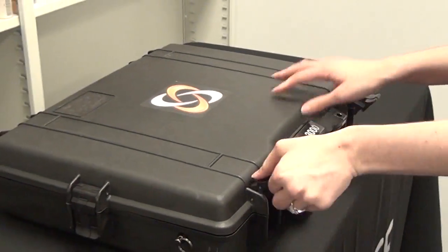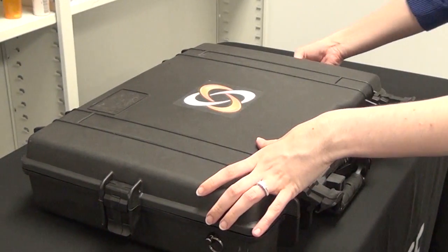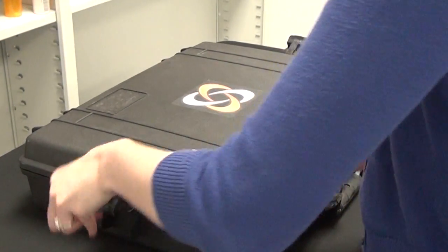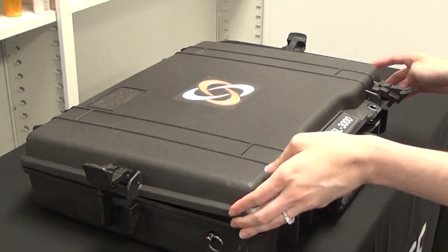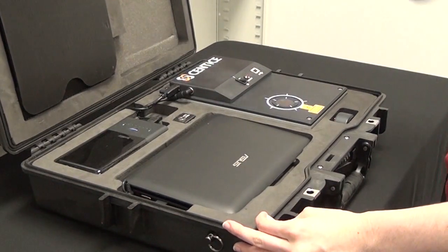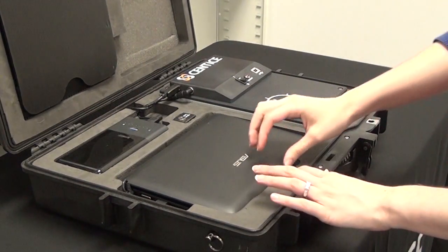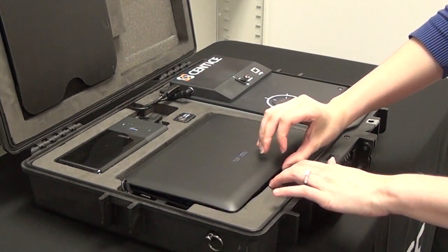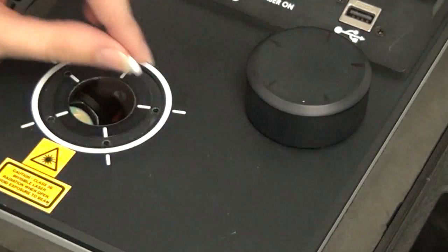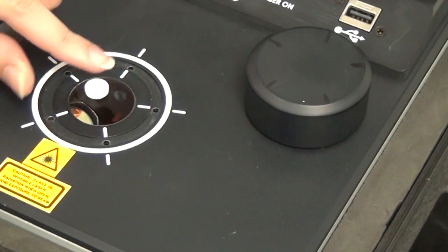The unit comes in a Pelican case, is mobile and rugged, and contains a Raman spectrometer on the right-hand side with a netbook that houses the application software and 3600 sample database.